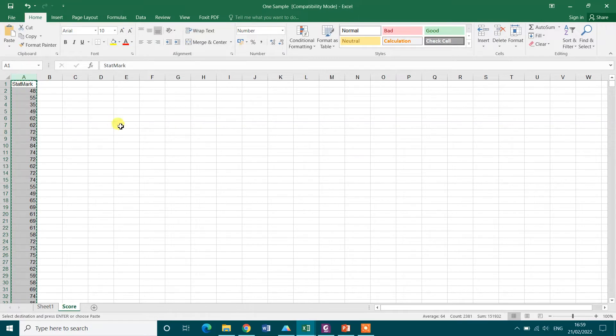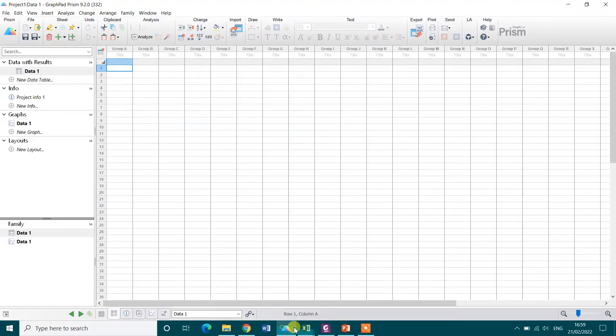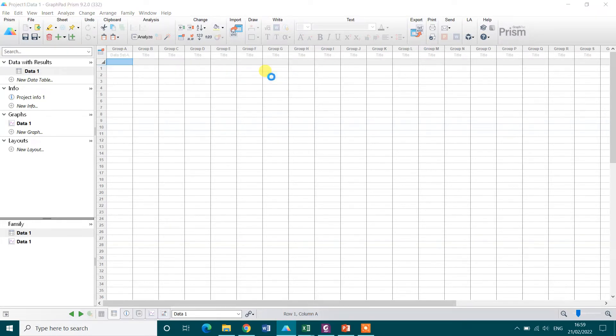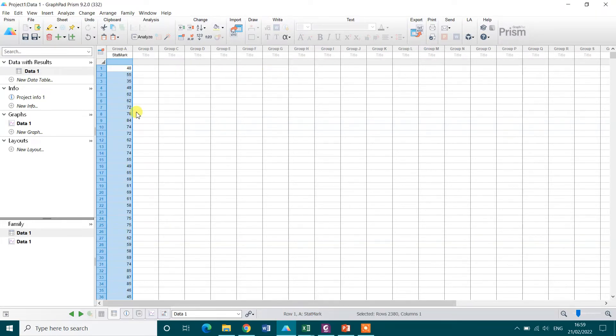So I need to copy it first, Control C, and then I need to paste it here. In the white cell click right button and then paste data or Control V. Now you see we got the data in the software GraphPad Prism.